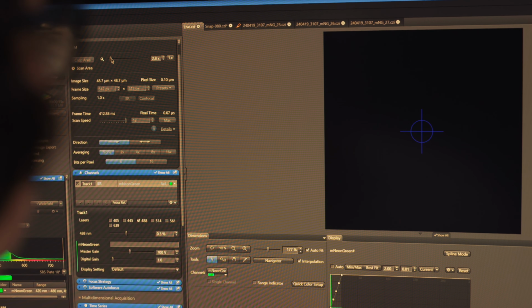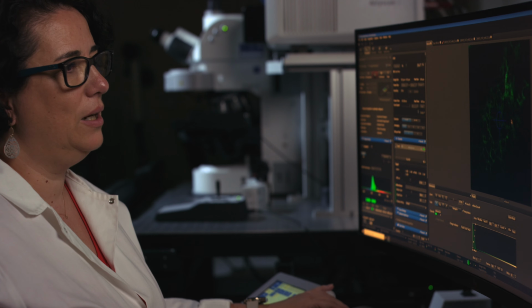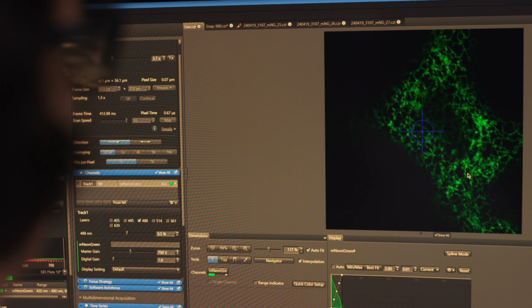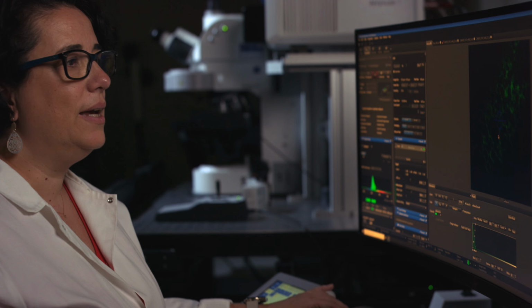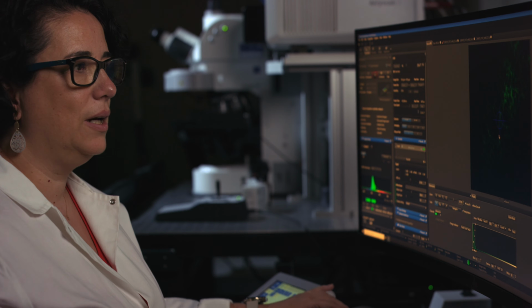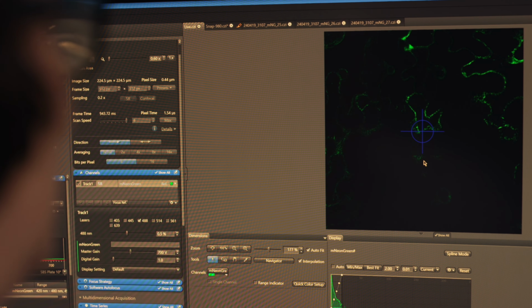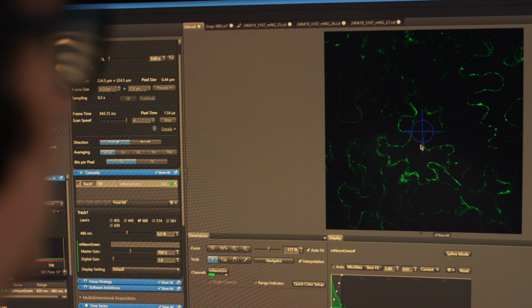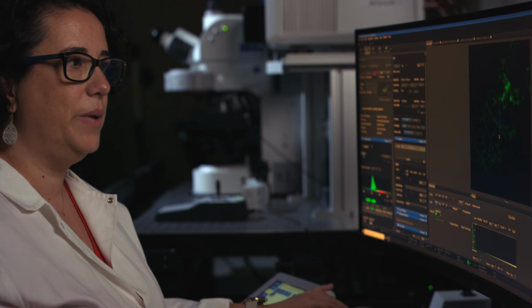Sometimes we have larger areas that would correspond to a so-called cisternae, and we can have also one element that defines the endoplasmic reticulum, these empty spaces that are called polygons. The size of the polygons, the balance between tubules and cisternae, the diameter of these tubules, these are all characteristics that define this network and help with the determination whether we have achieved this enlargement of the endoplasmic reticulum. What we have done here, we take pictures of the non-modified plant and the diverse mutant lines that we have generated, and we take several pictures.